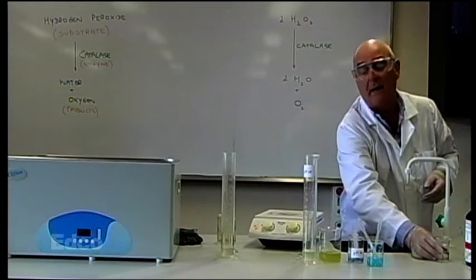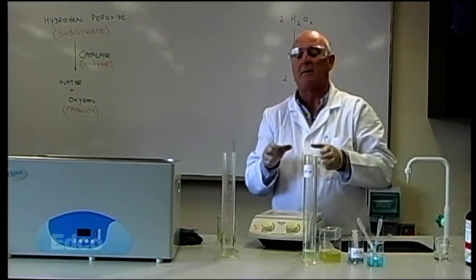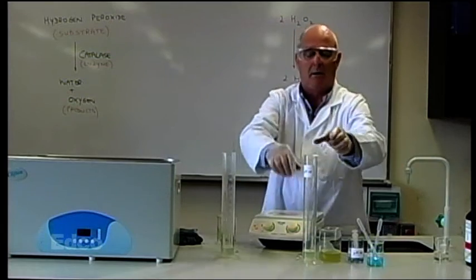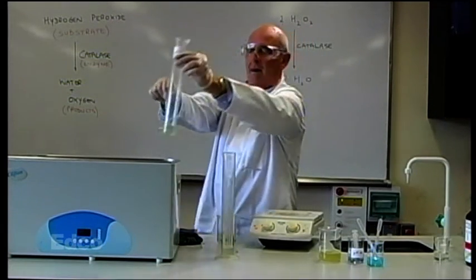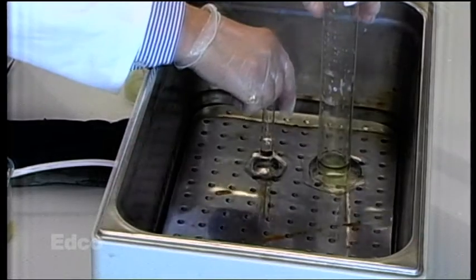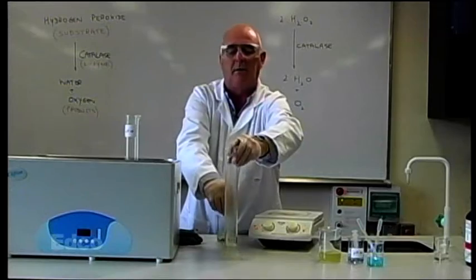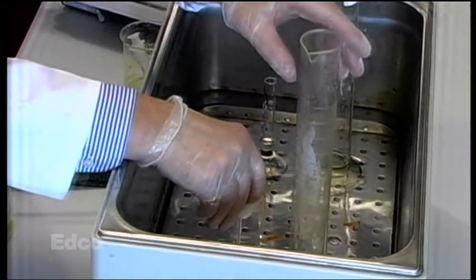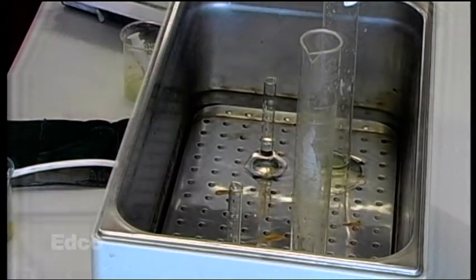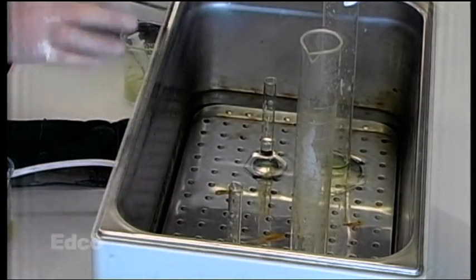Now, we want to run everything at the same temperature. Catalase works best at 25 degrees centigrade. So we transfer both of these into the water bath at 25 degrees centigrade. And both of these into the water bath at 25 degrees centigrade. And we leave them there for 10 minutes to come to the same temperature. So everything will be at the same temperature.